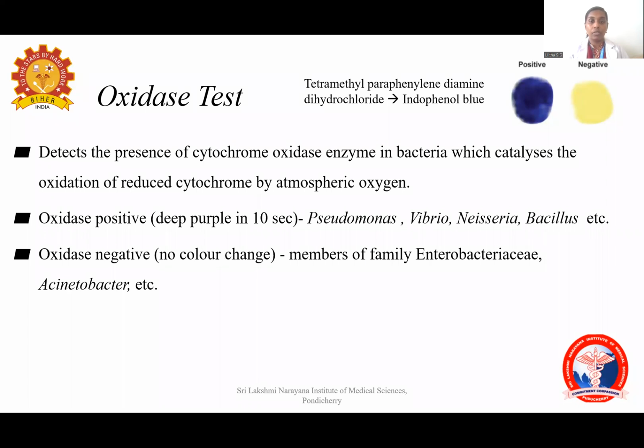And what we are using is called an oxidase reagent. This oxidase reagent is chemically tetramethyl paraphenylene diamine dihydrochloride. So we can do it on a filter paper strip.